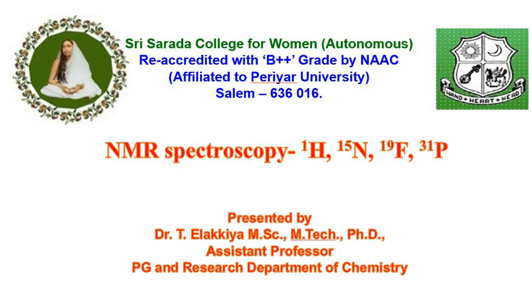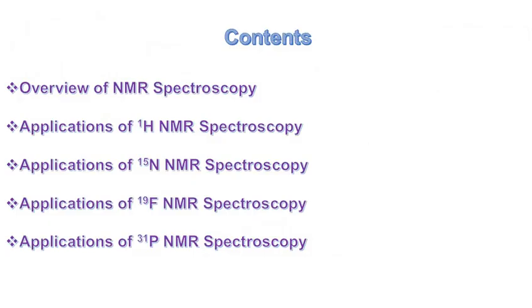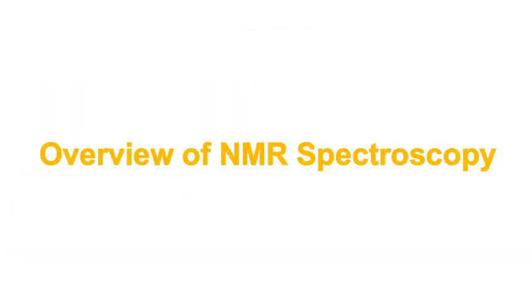Today, we will discuss NMR spectroscopy, proton NMR, N15, F19 and P31. Overview of NMR spectroscopy, then applications of proton NMR spectroscopy, applications of N15 NMR spectroscopy, applications of F19 NMR spectroscopy, and applications of P31 NMR spectroscopy.